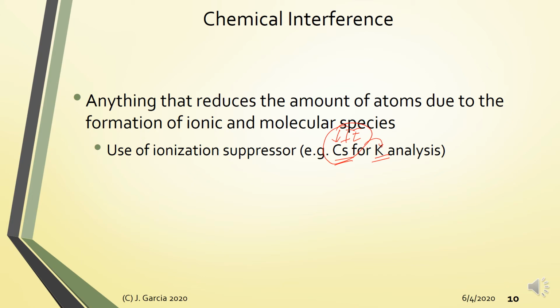If you're analyzing for sodium, then you can add potassium as your ionization suppressor, because again, potassium is more easily ionized compared to sodium.